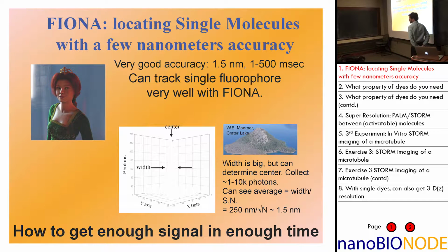So what properties of the dye do you need for STORM or PALM? For super resolution, would it have to be high intensity? High intensity. Why do you need high intensity? No, not necessarily. I guess dyes that can be excited with low intensity.